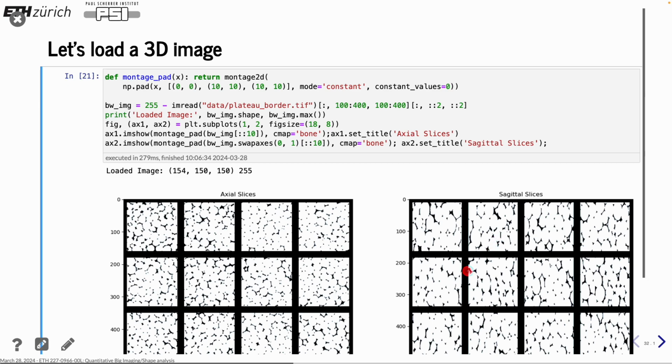And here you can see how the slices look. Was some compressed sand too? No, it was bubbles. And you can see that from the top view, you have what looks like just round pieces, and from the side view, you have ellipsoids that are packing up.